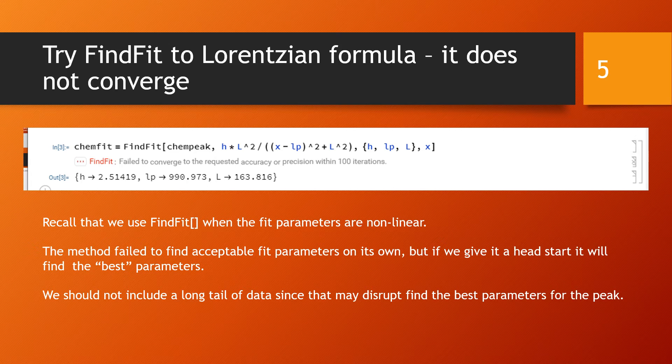Finally we want to point out one more thing, and that is previously when we fit this data in Excel, we were sort of using our own eye to fit the data, and the data had a long tail and we could just in our own mind de-emphasize the tail and focus on the peak. But if we're going to leave this over to some mathematical process, then we should just take that tail out of the data so that we really only have peak data, and therefore the best fit will be of the peak data because that's all there is.